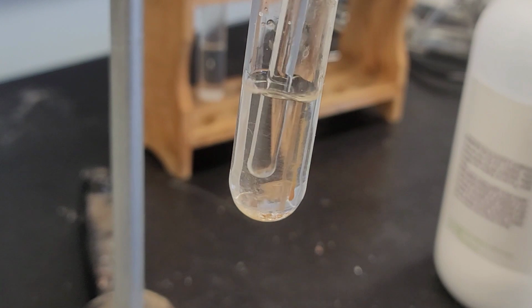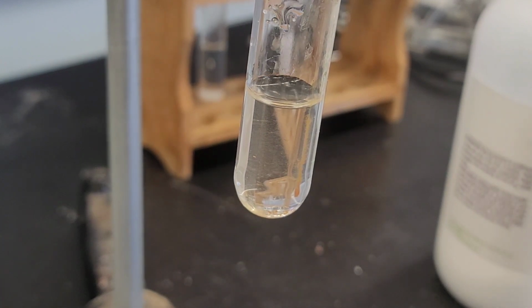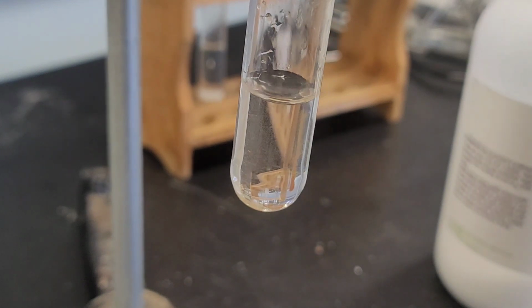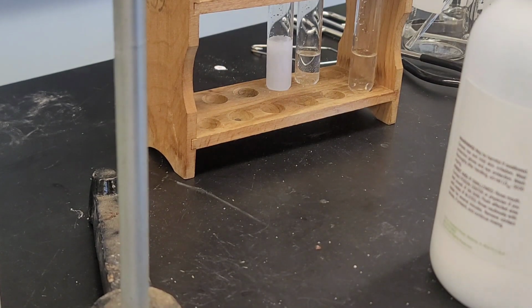All right, let's see. And we notice that all of the solute has dissolved, which means that this is an unsaturated solution, meaning not full. So all of the solute was able to dissolve in the solvent, water. Okay. What about a saturated solution?